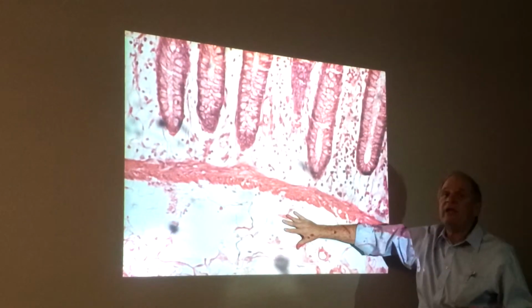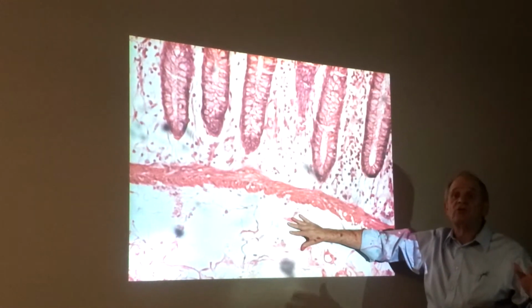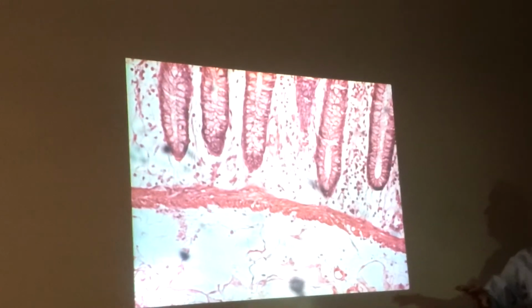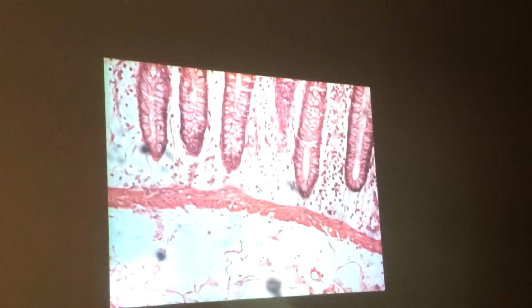It's very loosey-goosey arranged. It's real loosey-goosey, right here. It doesn't look like anything. Kind of spacey. Some connective tissue in there. All right, now let me show you something right quick.